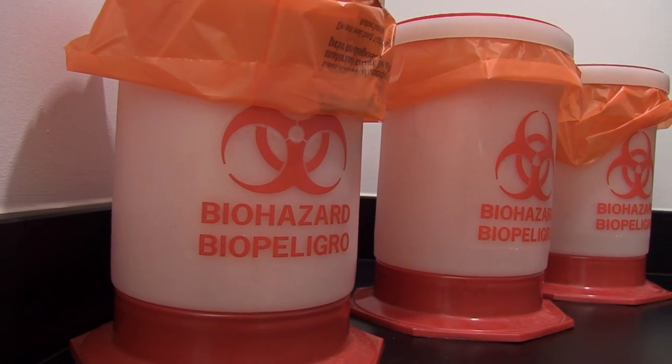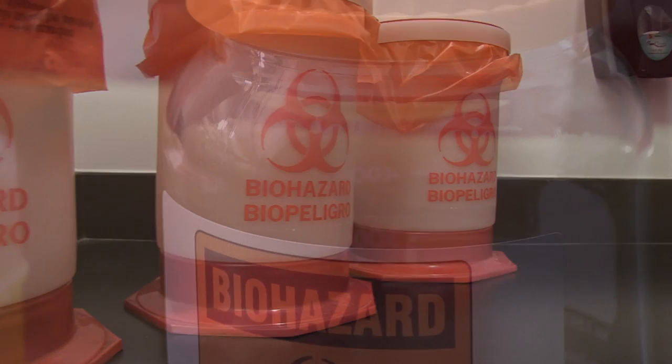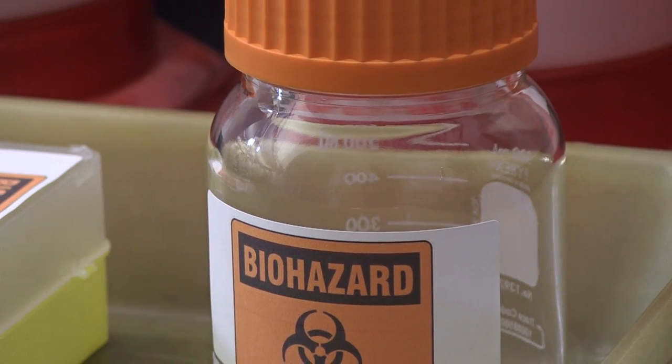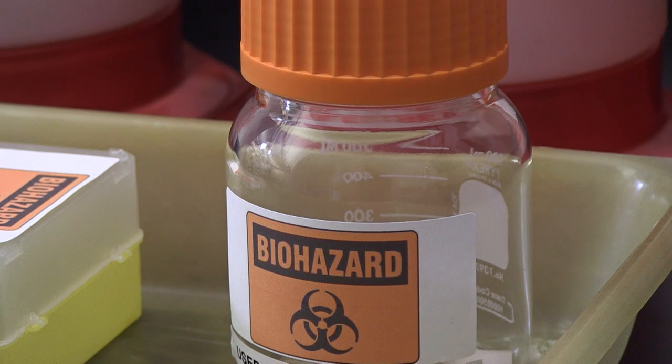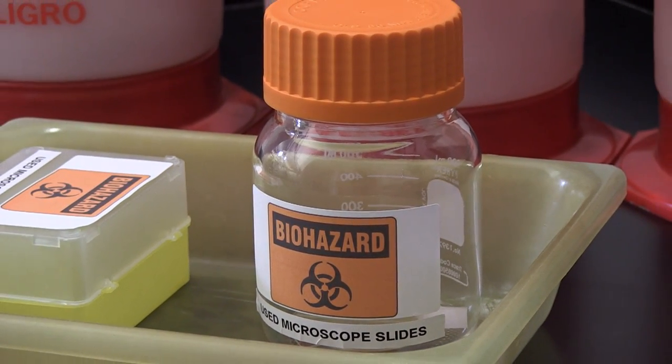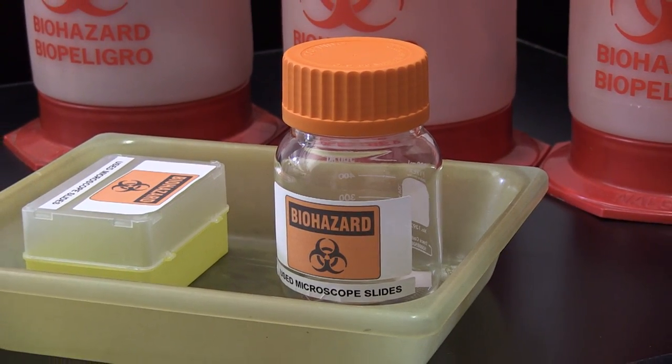The international biohazard symbol on the containers not only marks the contents for autoclaving prior to disposal, but also cautions anyone in the room as to the possibly hazardous nature of the items inside the containers. And remember, do not overfill the container and never force objects into the container.